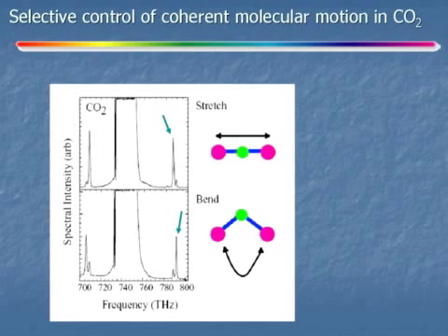And one route to doing that is to shape the pulses in time to selectively pick up signals related to the molecules of interest. And some older data here shows that you can find pulse shapes. This is just proof of principle data for carbon dioxide that shows you can selectively excite relatively close vibrational frequencies by shaping ultrafast laser pulses.